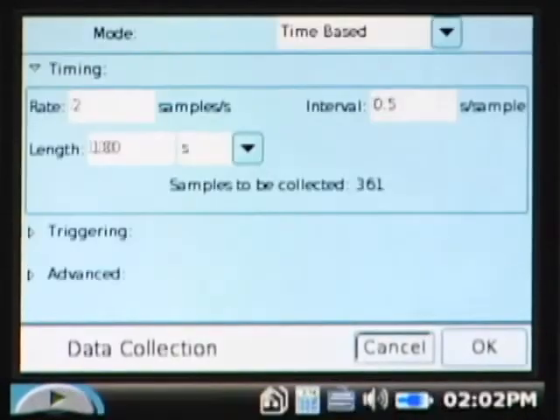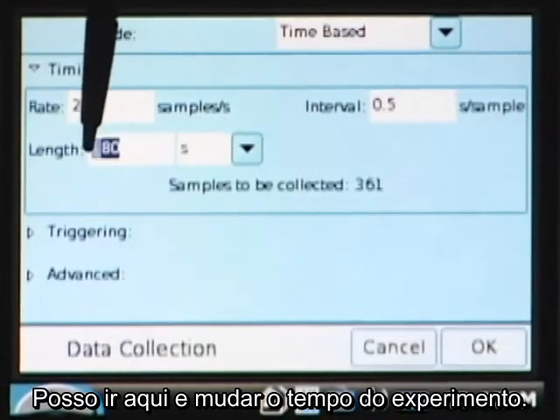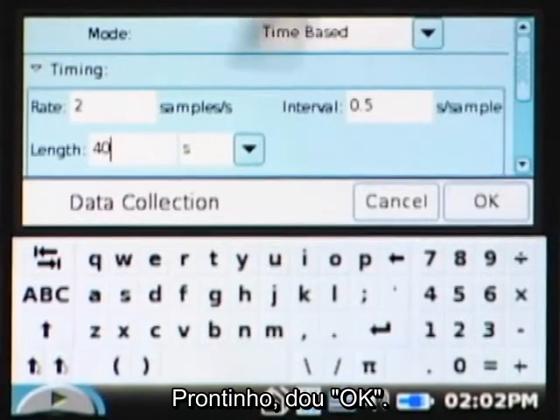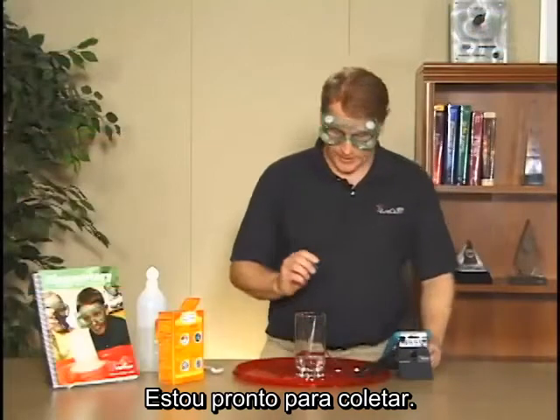It's very easy to do. I just come down and tap on length. And I can go here and change my experiment length. Instead of 180, I want 40 seconds. And there we go. So I say OK. And so now my experimental length is 40 seconds, and I'm now ready to collect.